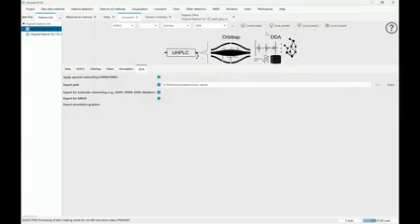So use these files to share, to harmonize the workflows in your labs, and then also, of course, to make it more reproducible. And in the publication, please don't put any tables, right? Don't put tables of, I use these parameters, because you're always going to forget to update some of these tables. And there's usually always parameters missing. But this file is a text file. You can read it. People can drop it into mzmine, and they can actually reproduce what you did. And it's going to define everything. You don't have to write parameters by hand. Okay? Right?